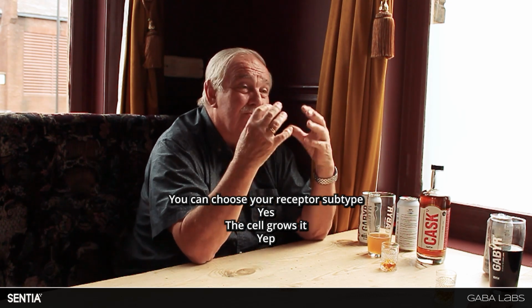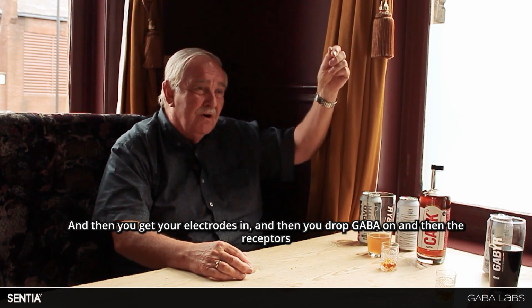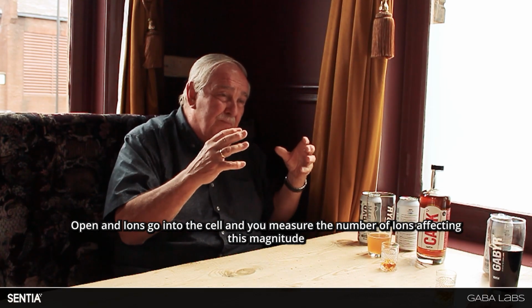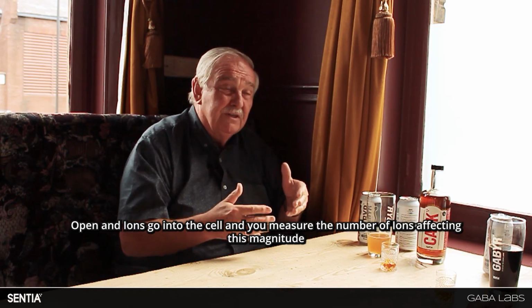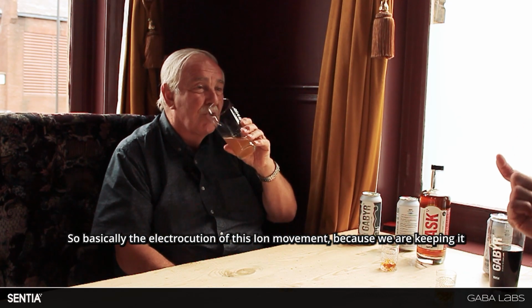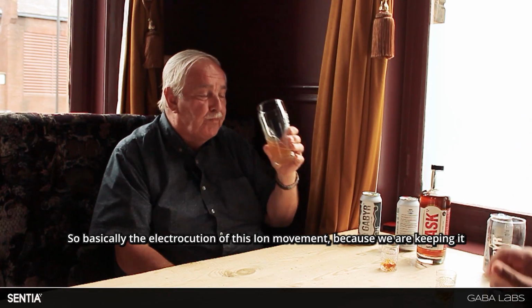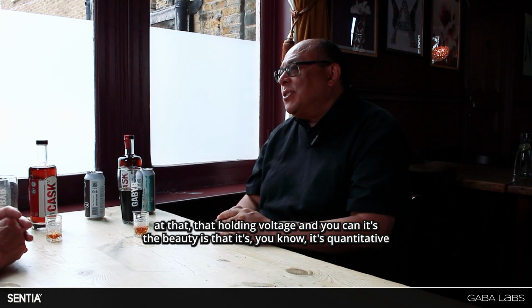The cell grows it. Then you put your electrodes in and drop GABA on, and the receptors open and ions go into the cell, and you measure the magnitude of the ion movement, because we are keeping it at that holding voltage.